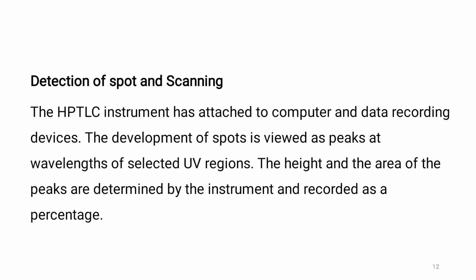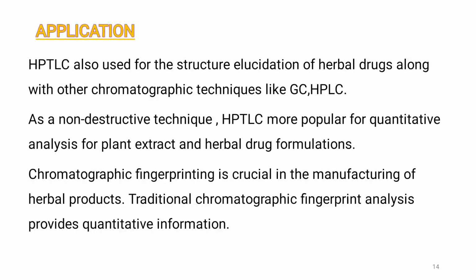Now move to the next point, that is, applications of HPTLC. HPTLC is one of the most widely applied methods for analysis in pharmaceutical industries, chemical industries, clinical industries, then forensic chemistry, biochemistry, cosmetology, food and drug analysis, environmental analysis, and other areas. It is due to its numerous advantages.